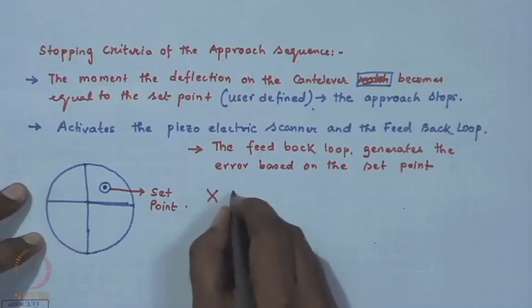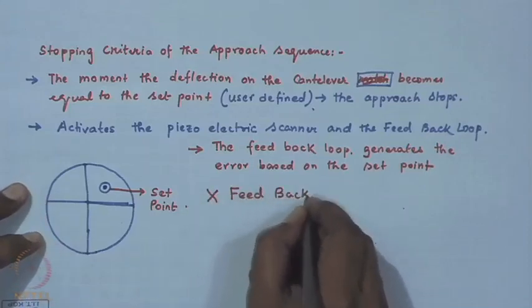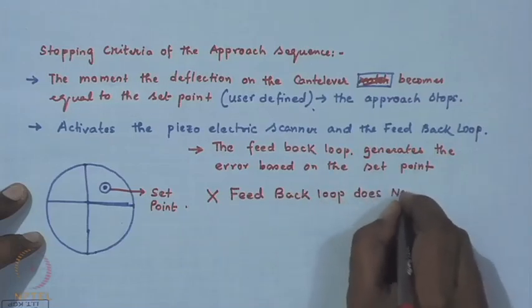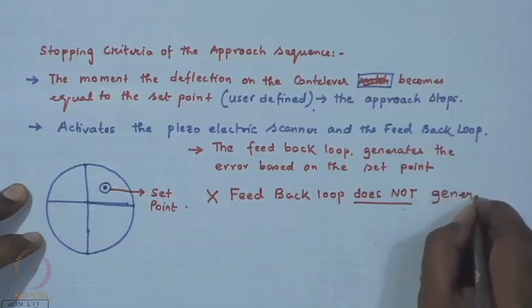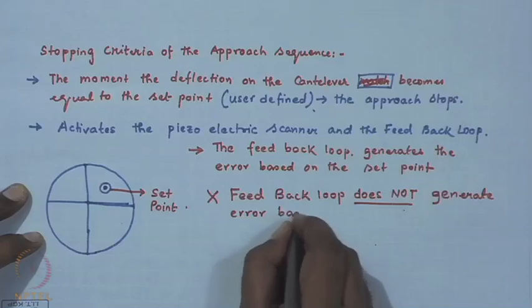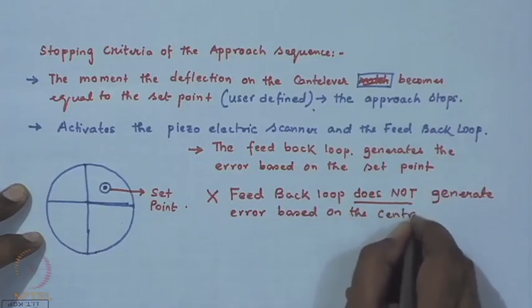The feedback loop, I will write it down and keep this in your mind. Feedback loop does not generate error based on the center. Okay.